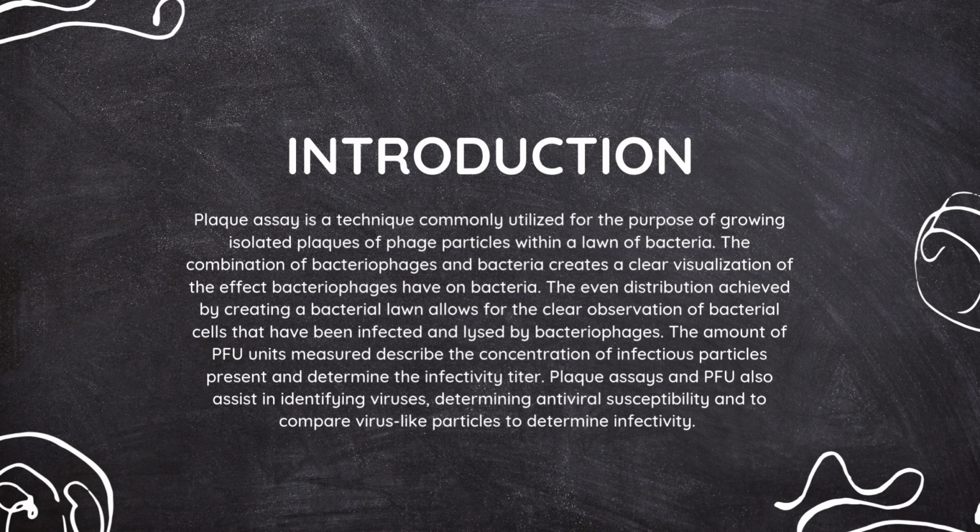The amount of PFU units measured describe the concentration of infectious particles present and determine the infectivity titer. Plaque assays and PFU also assist in identifying viruses, determining antiviral susceptibility, and comparing virus-like particles to determine infectivity.